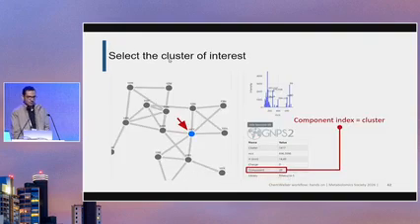Here we have a selected node in a cluster. This selected node was annotated as rifamycin-S. And here we have the MS/MS spectrum of rifamycin-S, the ID of the node corresponding to this annotation, the precursor ion of rifamycin-S and retention time.